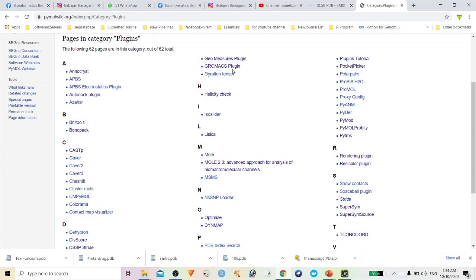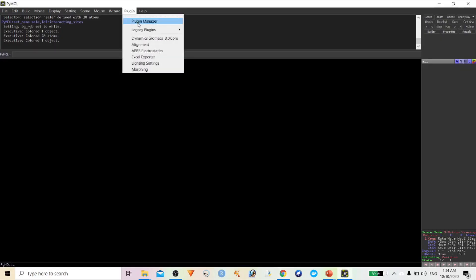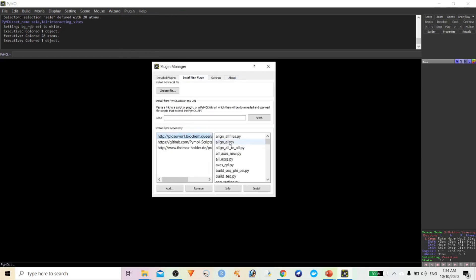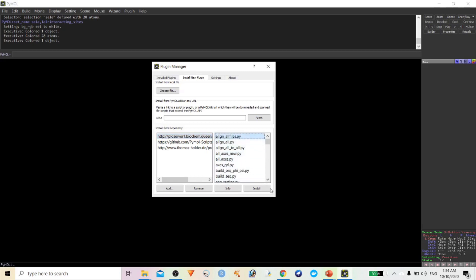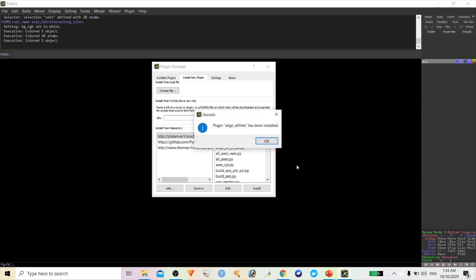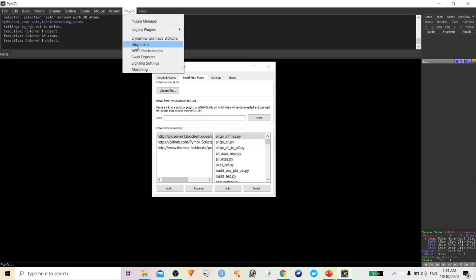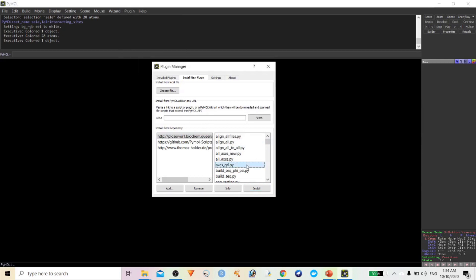I'll show you how we can install them. Simply go to Plugin, click on Plugin Manager, then click Install Plugin. You will find different types of plugins to identify RMSD and check alignment. I'll install the alignment file — click on the file and click Install. Once done, it will show that installation is complete and the alignment plugin has been installed.